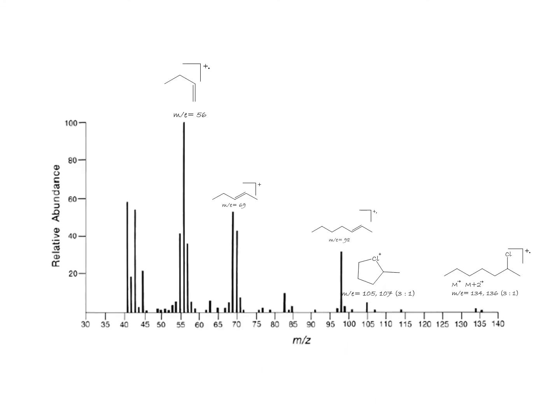This is a molecular ion. This is a cyclic halonium. This is elimination of HCl. This is a peak at 69, and this is the one at 56.